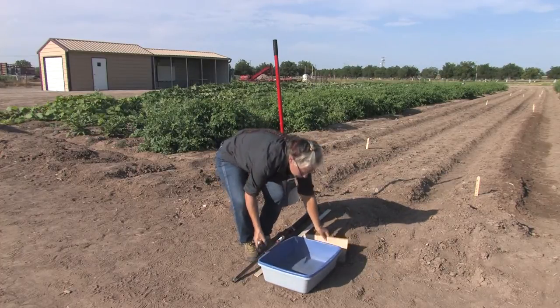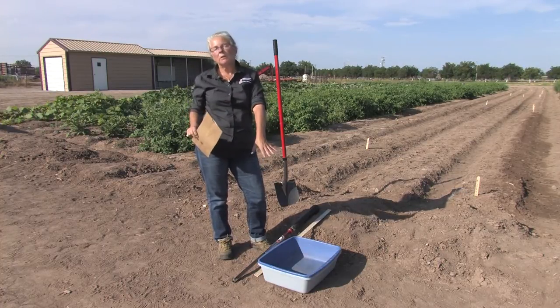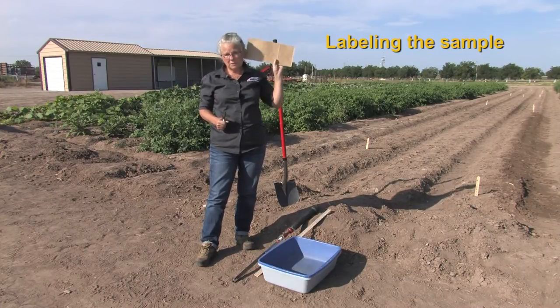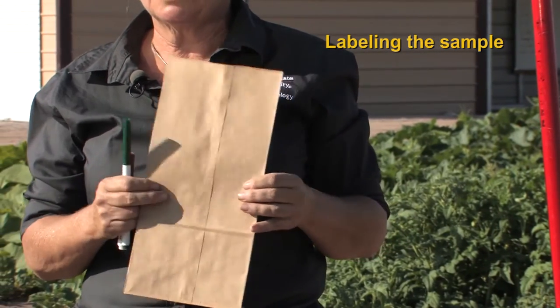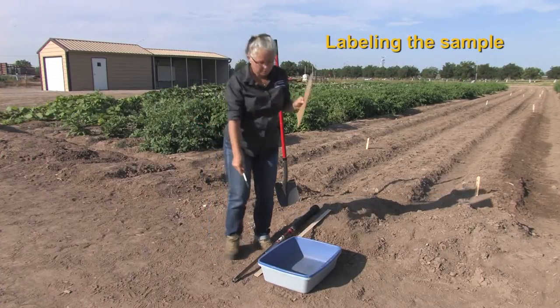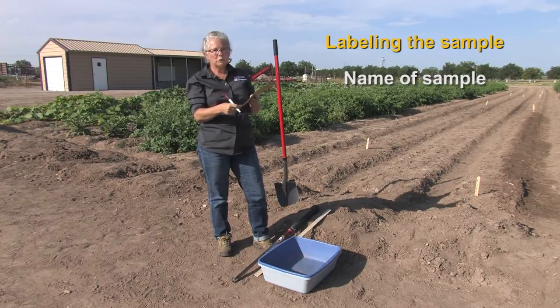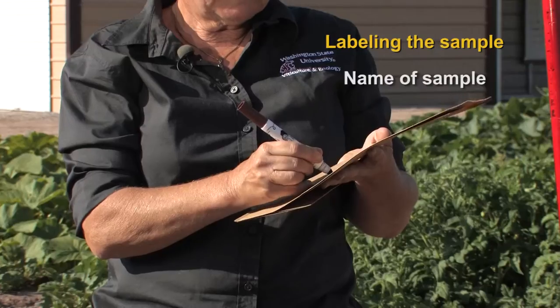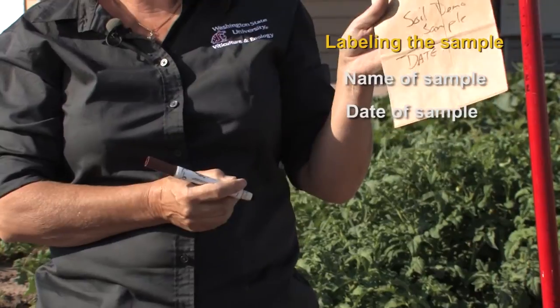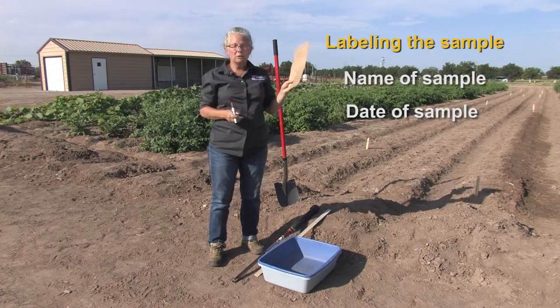When collecting the sample, typically you will collect more than you actually need, and that's a good idea. Then we take the sample from our sampling container and put it into a bag. The type of bag is really up to you — this is a paper bag, which is a good size. I sometimes also use a quart size Ziploc bag. What's very important is that you label the sample bag, not only for the test lab you send it to but also for your own record keeping. Include a sample name or identification, and importantly, put the date of your sampling on it so that you have a record of when you collected the sample.